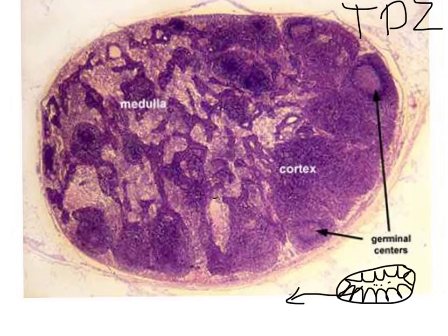So you may be asked, what is the origin of this T lymphocyte? It is from the thymus. They leave the bloodstream and reach the cortex, the deep area of the cortex, through post-capillary venules. Post-capillary venules are lined with simple cubical epithelium, but the cells here are high. Simple cubical epithelium with high cubical cells.